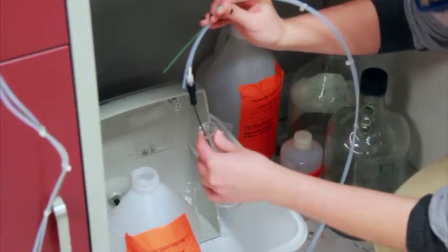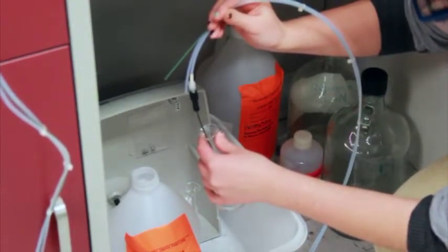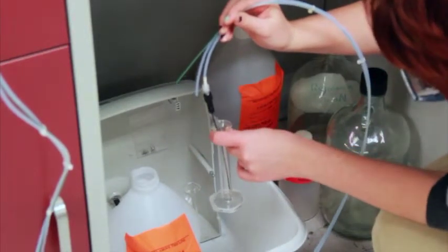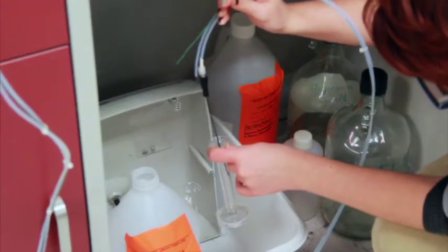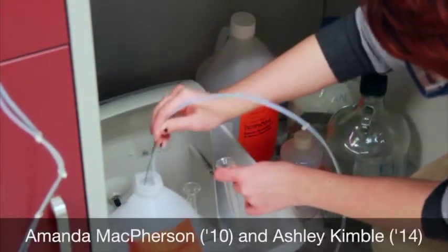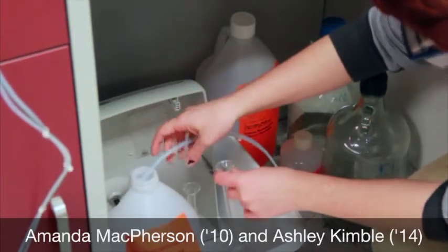If the flow rate is less than 1 milliliter per minute, then you need to wait another 10 to 15 minutes and check again. If there is less than 1 milliliter per minute, and the instrument has been equilibrating for 40 to 60 minutes, then find either a lab assistant or the instructor and check again.